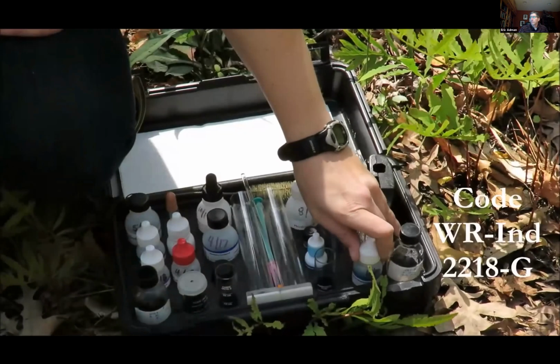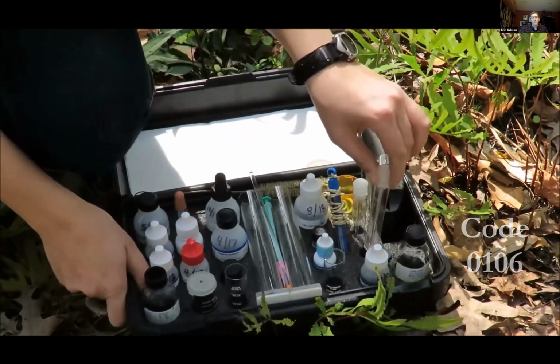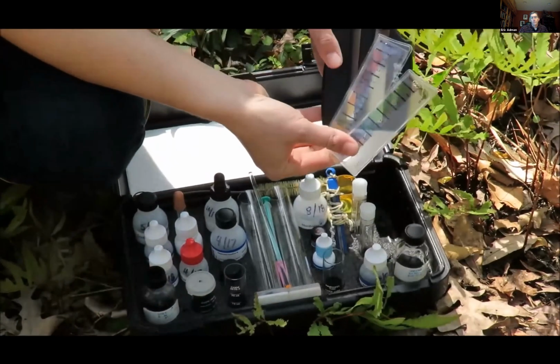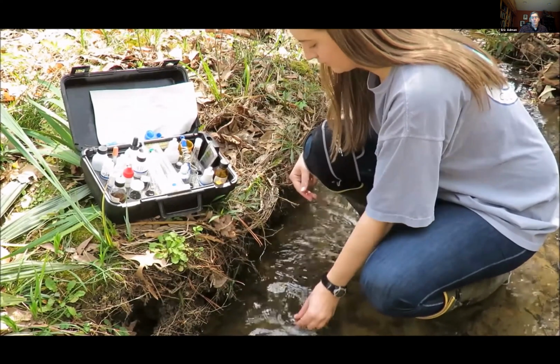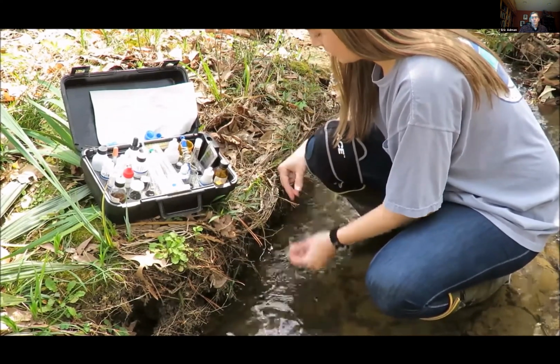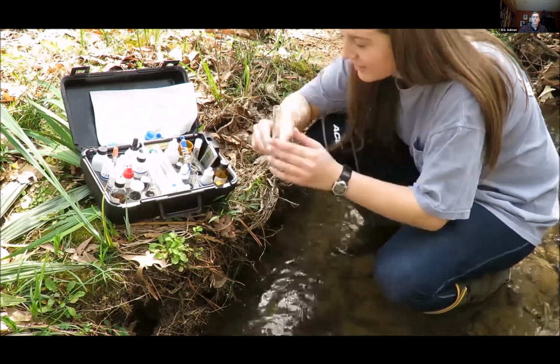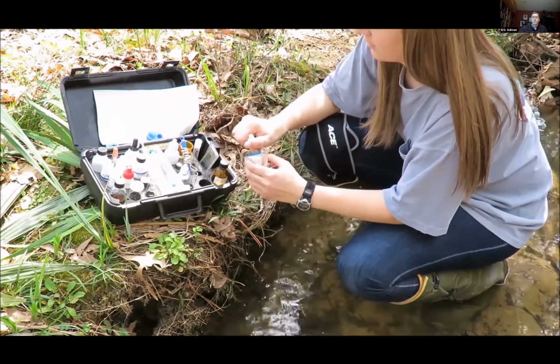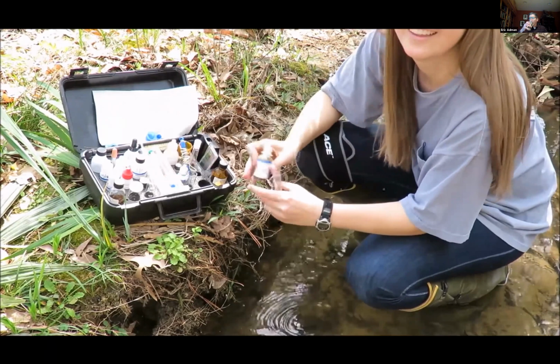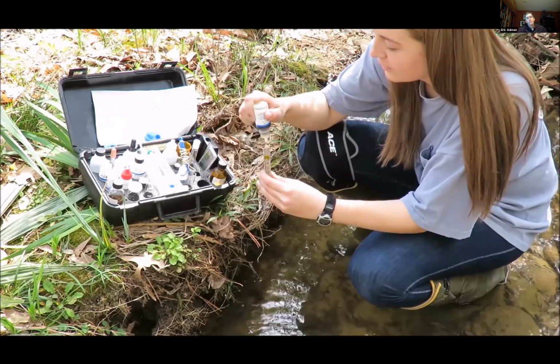For this test, you will need the wide range indicator, small plastic tube with cap, and the OctaSlide viewer with both OctaSlide color bars. Remove the small plastic tube from your kit and rinse 2 to 3 times with water from your site. Fill the tube above the line with site water and flick out excess until the bottom of the meniscus touches the 10 milliliter line. This is your sample. Locate the wide range indicator bottle in your kit. Add 10 drops to your sample. When dispensing the reagent, take care to hold the dropper bottle vertically. This ensures uniform size drops.